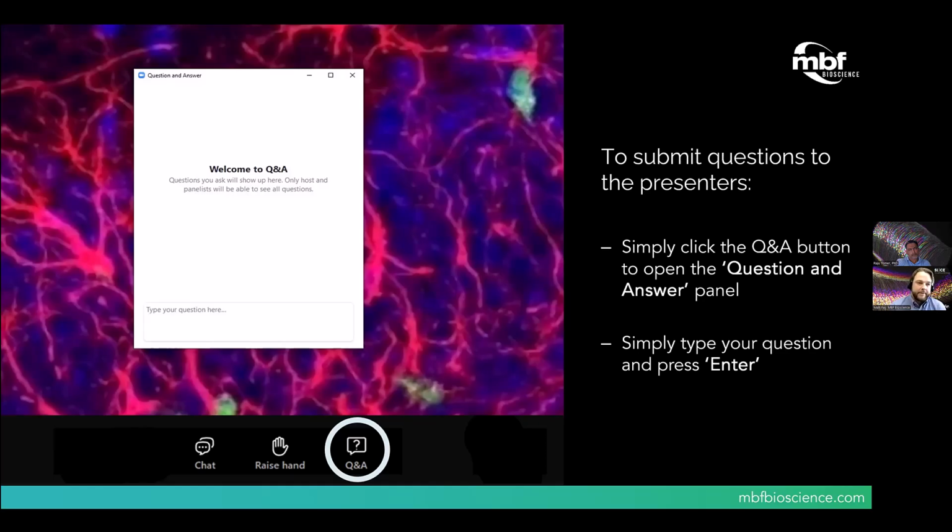But I typically don't like to add any more points than I need, since it takes time to create those focus points. Typically for a mouse brain that's homogeneously cleared, I put two points spaced apart towards the top and towards the bottom of the sample, and that's been sufficient.